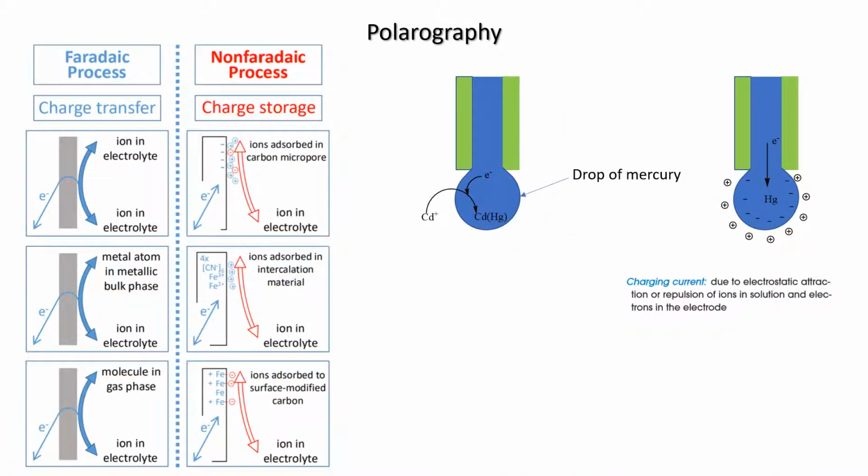One of the issues with this, and indeed with any type of voltammetry, is the buildup of charging current. The redox processes we investigate by transferring electrons at the metal surface, known as Faradaic processes, give us current responses largely proportional to the amount of reagents transformed by electron transfer.